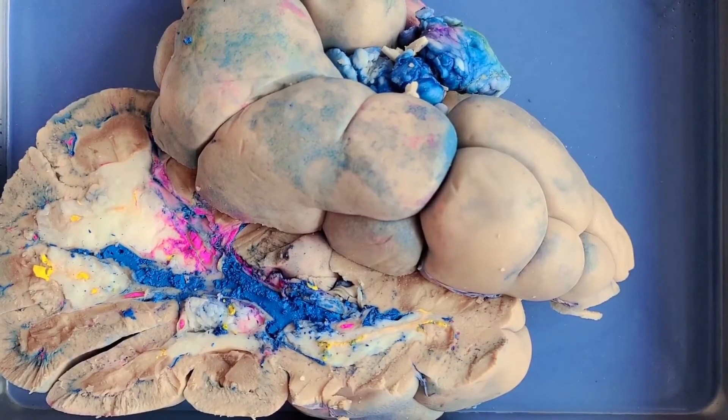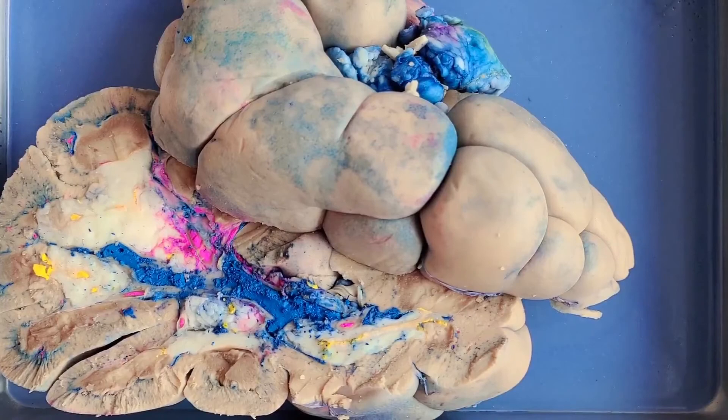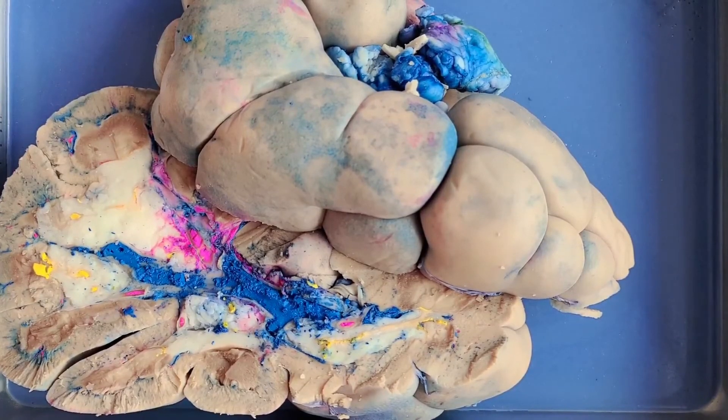That's the end of the kidney dissection. Thanks for staying, friends. Here's a fun fact to send you on your way: if you stretched all the nephrons in one human kidney and laid them end to end, they would be around 40 miles or 60 kilometers long.